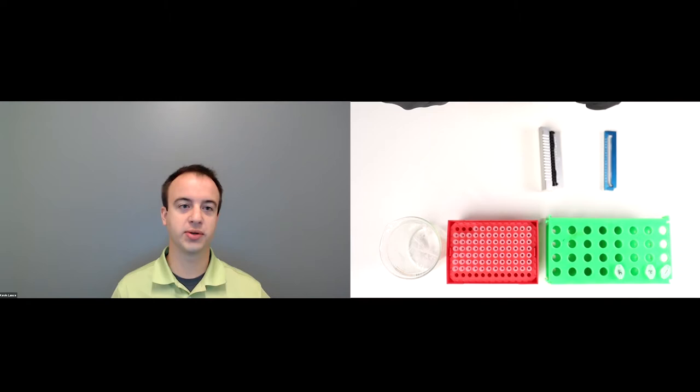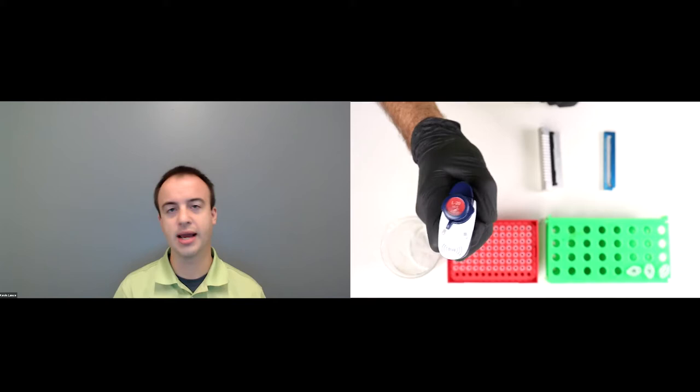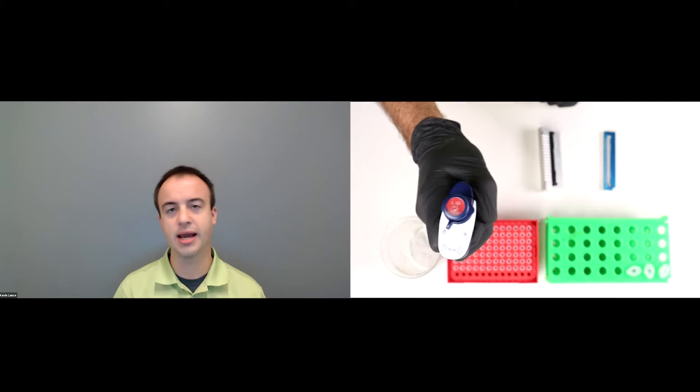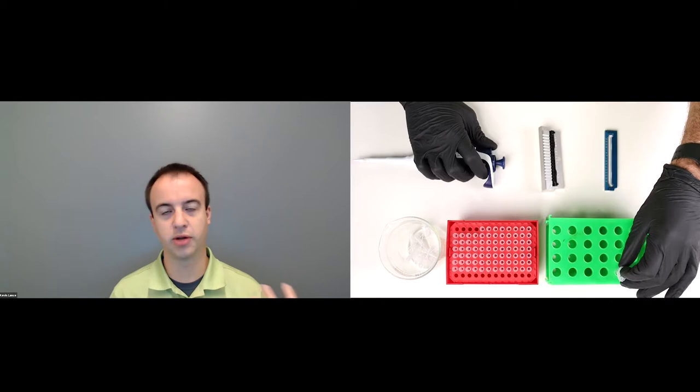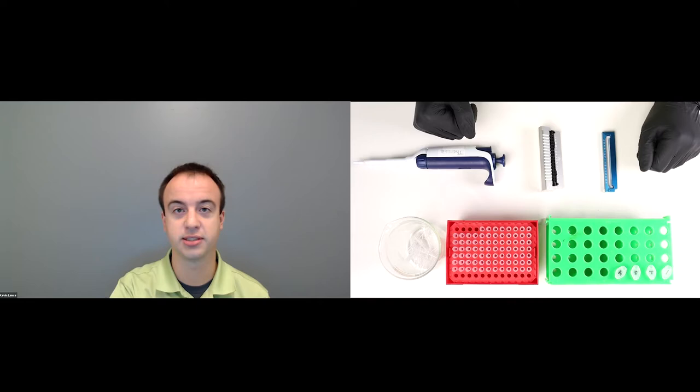Beyond isothermal experiments, light scattering also has some pretty cool applications in KD, B22, and G22 applications, which look very specifically at the DLS and SLS readouts of UNCLE to understand if your protein is vulnerable to self-self interactions in the formulation. KD and B22 are useful for dilute protein concentrations — 10 milligrams per mil and below for an antibody. G22 is particularly chosen for high concentration antibodies, something in the neighborhood of 50 milligrams per mil all the way up to 100 milligrams per mil and beyond. Very useful if you're formulating for a subcutaneous injection.